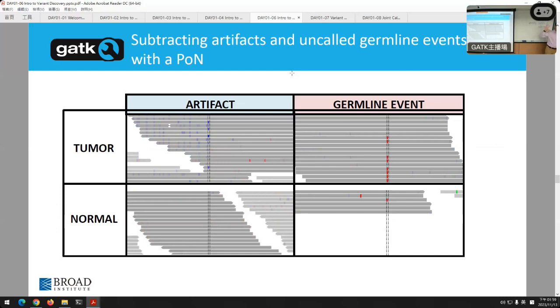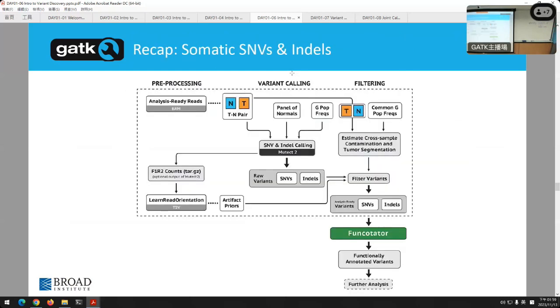99.99% confident, it's bright blue. But if it's a Q10, only 90% confident, well, it's kind of faded. So you see there's a lot of faded things around here. So we use that as signal to say, look, this is not real. I see the same thing in other samples also, so we'll remove it. And we will do a lot of this on Wednesday.